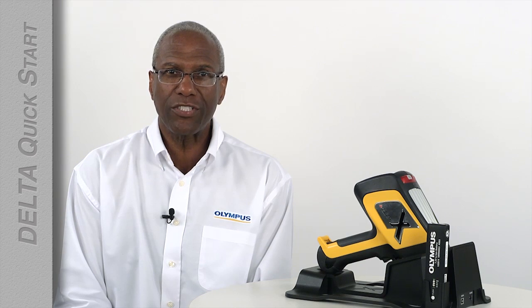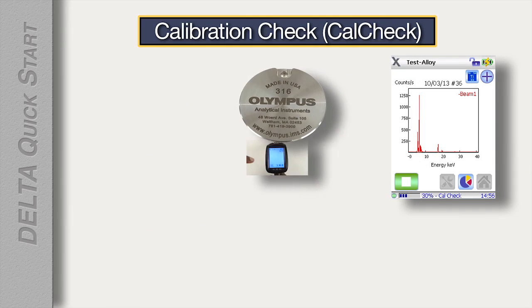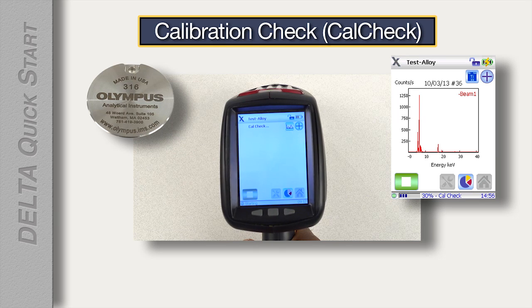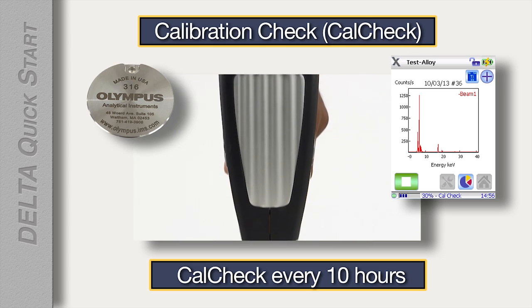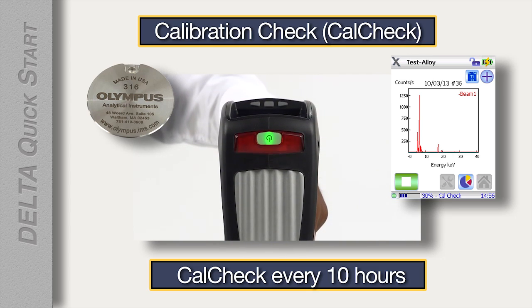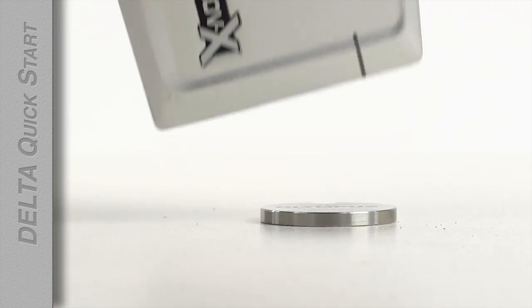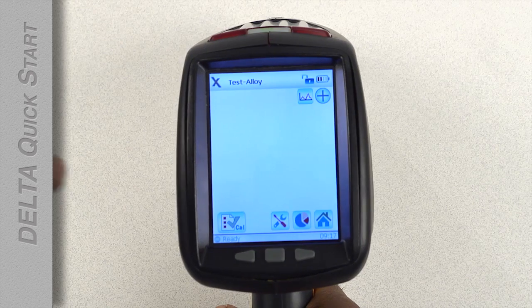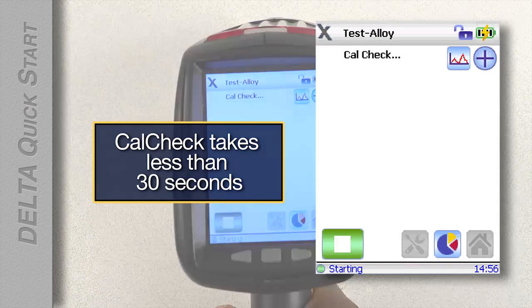Because this is your first time using the analyzer, it will need a calibration check. The calibration check, or CalCheck, makes sure that the analyzer is working correctly. The analyzer will need a CalCheck approximately every 10 hours, whether it's being used for those 10 hours or not. Put the CalCheck coupon on a flat surface and place the analyzer window on the coupon. Tap the CalCheck icon on the analyzer screen. CalCheck will take less than 30 seconds.